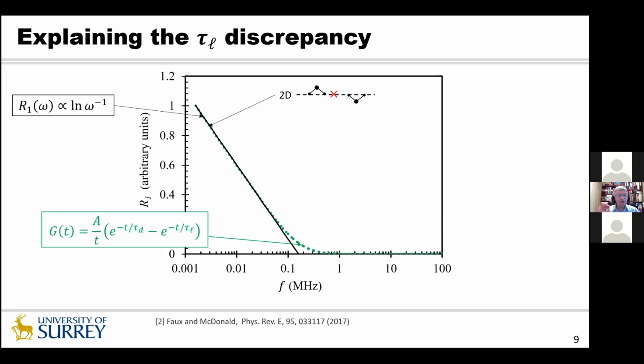And you see there's a beautiful match in the low frequency range between the known low frequency limit in this instance and the Korb constructed correlation function that we need as the first step of the calculation, which is then Fourier transformed, etc., to get the relaxation rate. So all is going well at this point. However, this is a construction. This expression in the green box is a construction.